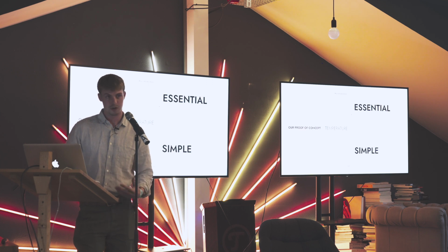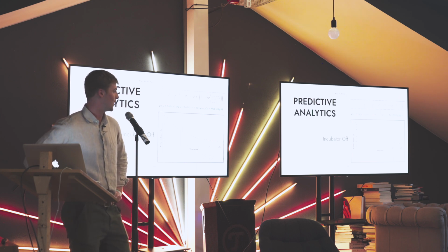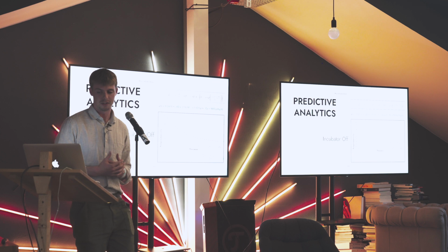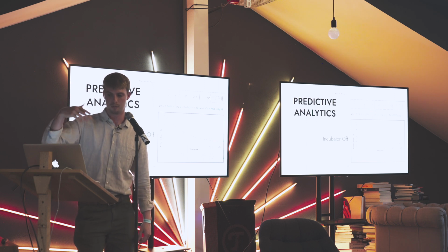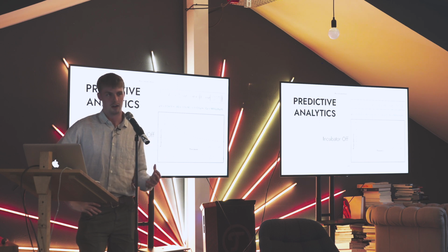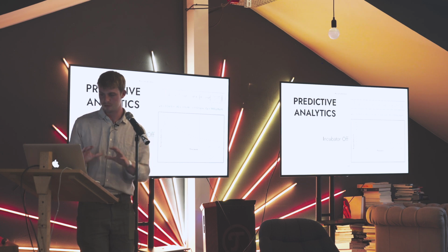This brings us to what we're trying to do with it now. This is our proof of concept and some complicated engineering mathematics. My amazing colleague Javiera has done some complicated modeling and mathematics to track what happens to temperature sensors when things go awry. This is when an incubator has a power cut, and through modeling you can see immediately, within 5 minutes I think, the direction it's going and get an alert back, and then have all your samples saved, effectively so your protocol isn't ruined. That's our proof of concept right there.